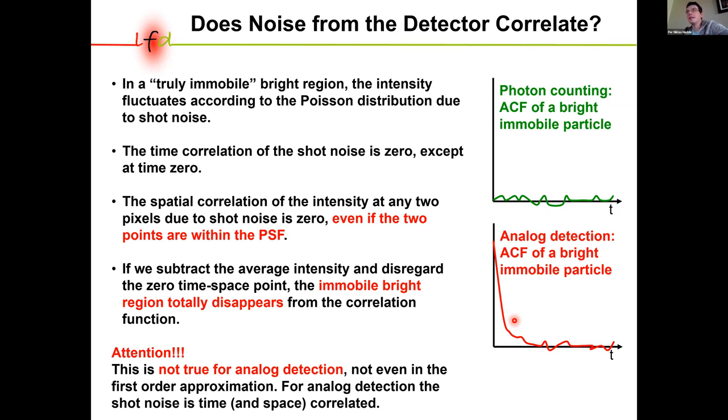So we can only analyze the non-zero pixel and line delays.